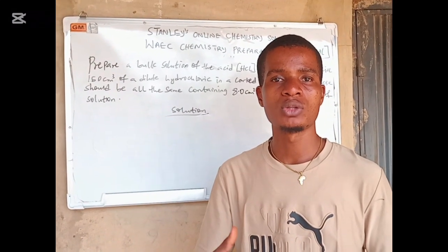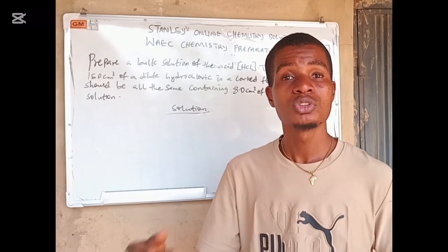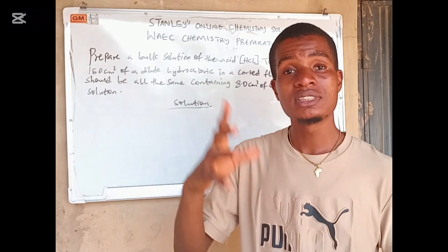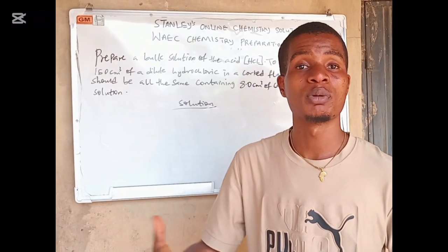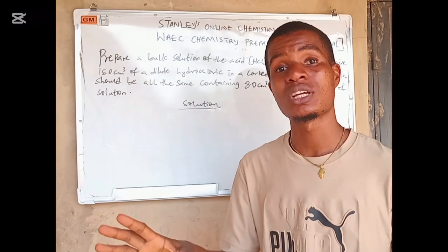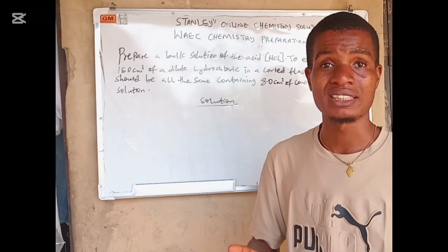Some students don't know how to do it, and some teachers don't know how to do it. It's not the work of the student, but students need to know how to do it because a question like that may come in theory. But some teachers don't really know how to prepare these solutions, right? So this video is for both the students of chemistry and teachers regarding preparing bulk solutions for WAEC practical chemistry.